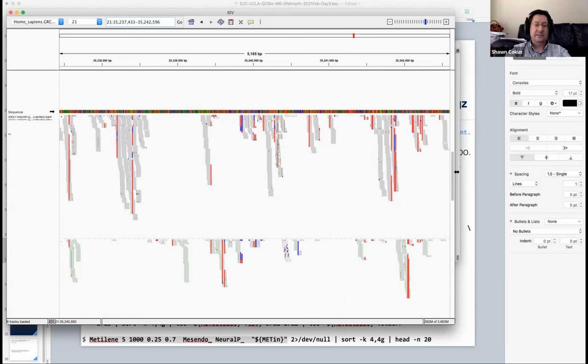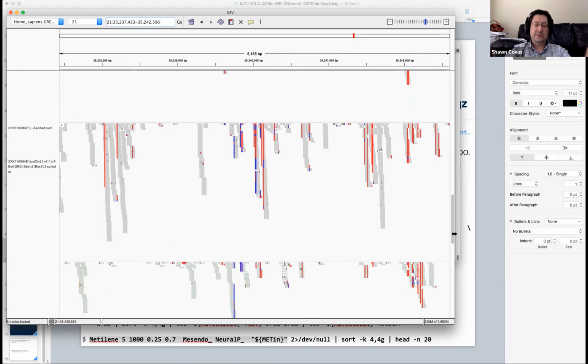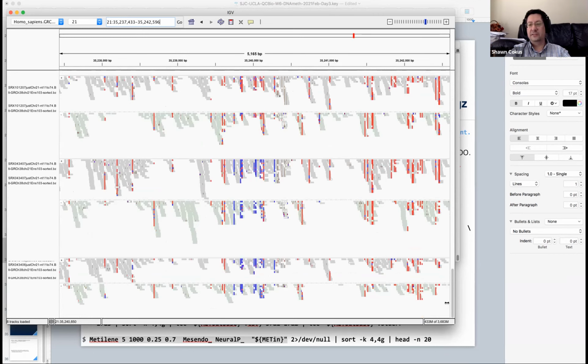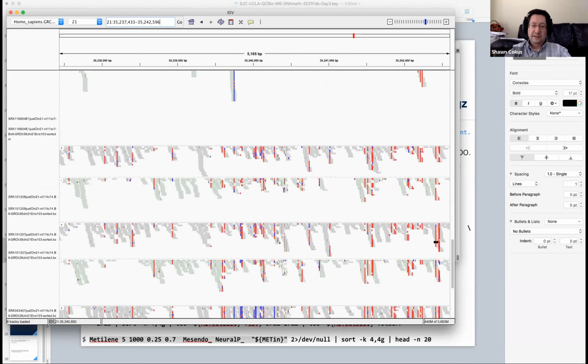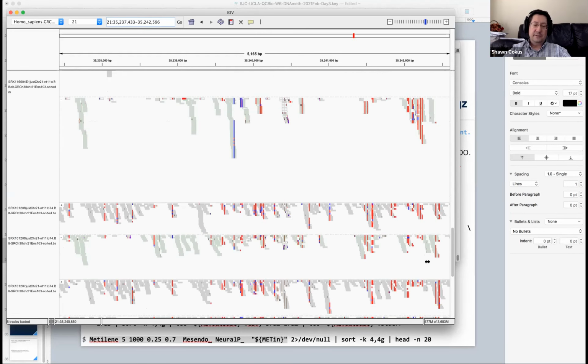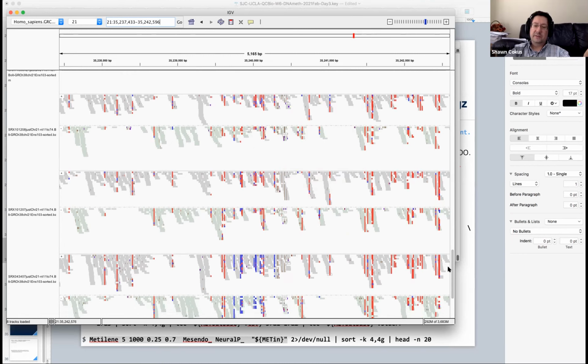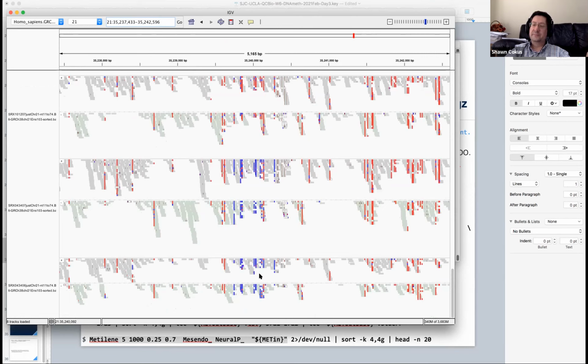Let's just look and see whether we've got something that looks good. Okay, so here we're scrolling down. Let's scroll through it first once, and then we'll go backwards, and we'll see whether we're like, wow, it looks good, right? So here, I think which two samples we compared, but IGV is showing 2 strands. I've got it grouped by strand, plus and minus strand, and then 2 samples in each tissue. So there's 4 IGV rows per condition. And that's red in the center, and this is blue.